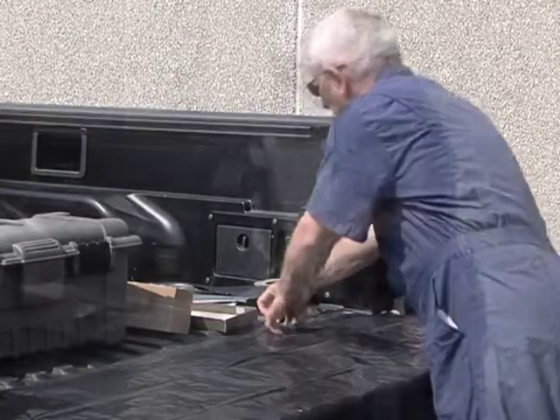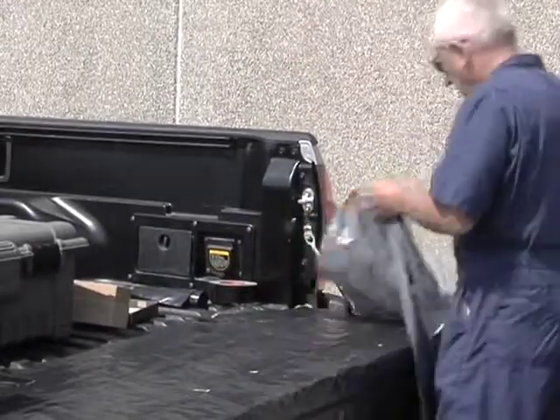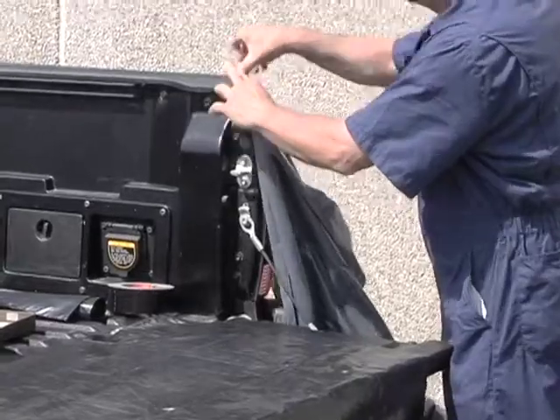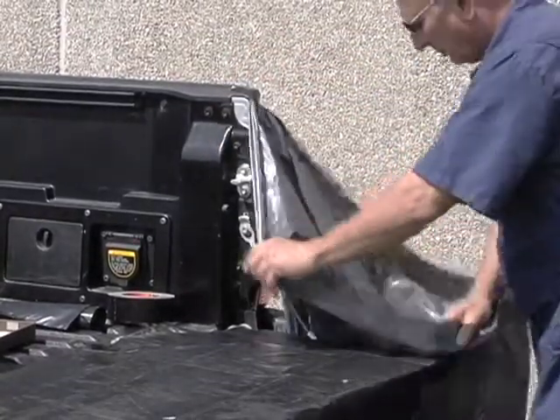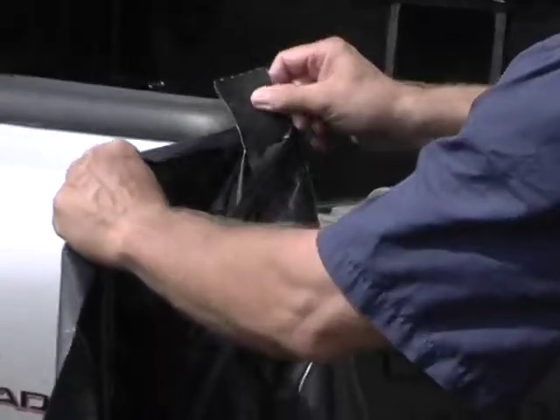Next, tape a trash bag to the left and right sides of the pickup. The trash bag on the right will be used to discard trash, like the used Dacron swabs. The trash bag on the left will be used to discard the chickens after they are sampled.